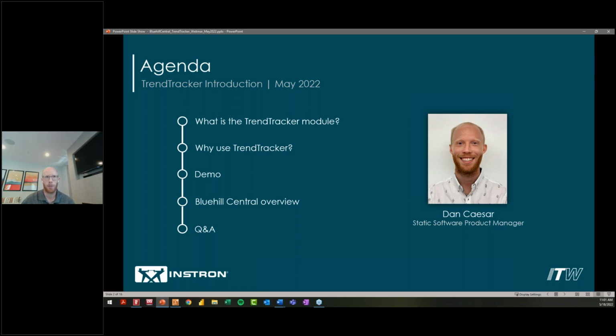I just wanted to start with an agenda today. We are going to be introducing TrendTracker, so we want to start off with exactly what it is, what its core functions are, and then get into what value it has. Why do people use TrendTracker? How does it help them in their day-to-day operations? Then we'll jump into a live demo of the product and how it's not only integrated into Bluehill Central, but how it's integrated with our testing software, Bluehill Universal.